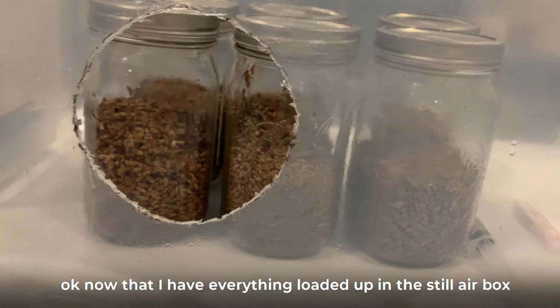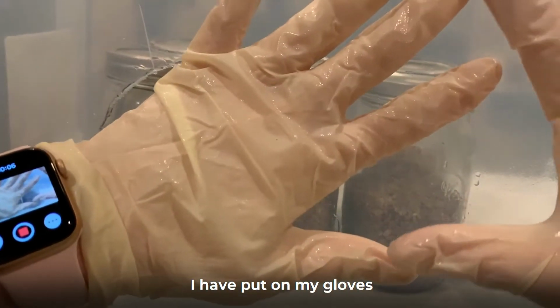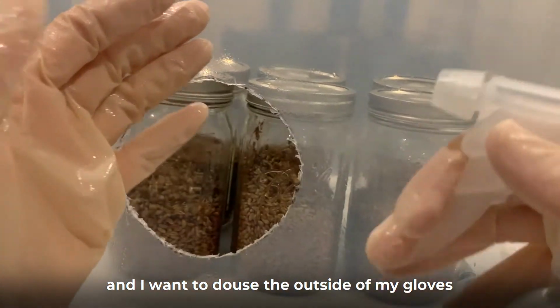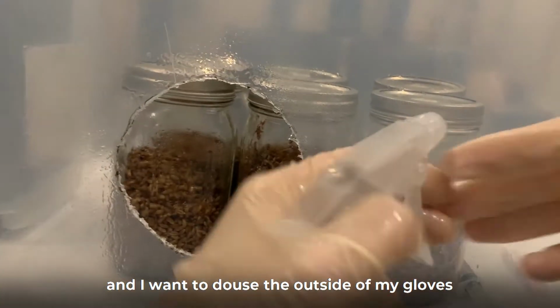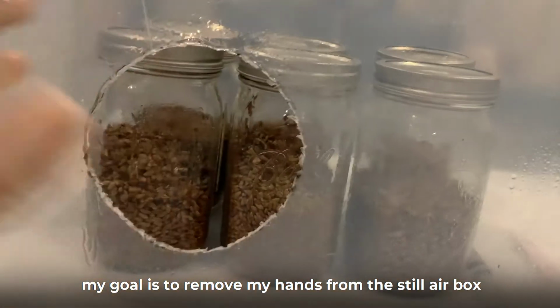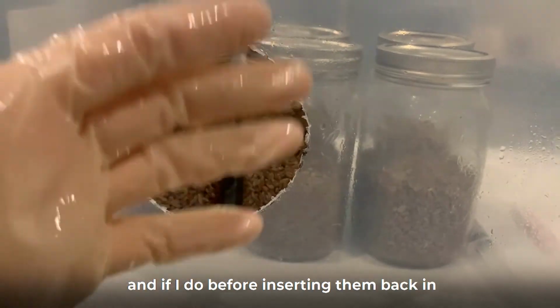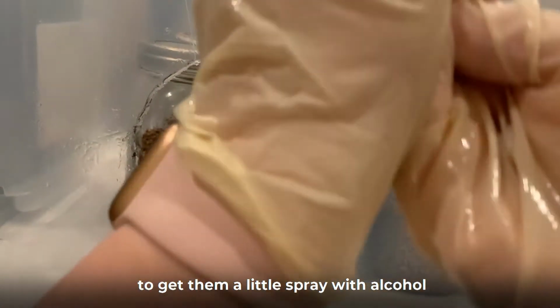Okay, now that I have everything loaded up into the still air box, I put on my gloves and I want to douse the outside of my gloves with the rubbing alcohol. My goal is to remove my hands from the still air box as little as possible, and if I do, before inserting them back in, to give them a little spray with alcohol.